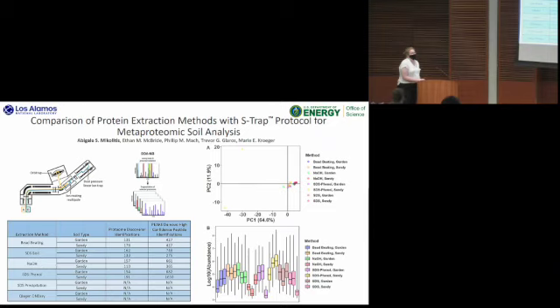No, but part of the issue is we only had the 3 FASTA files. We had a very large FASTA file that we were using for the identifications, and it kept clogging up PD and it wouldn't run it. So we simplified down, and we picked the top 3 FASTA files for each. If we add more of a database for it to pull from, we would anticipate higher counts. Also, we loaded only 25 micrograms of protein onto the S-traps, so that could have been a factor as well. Okay, makes sense. Thank you.